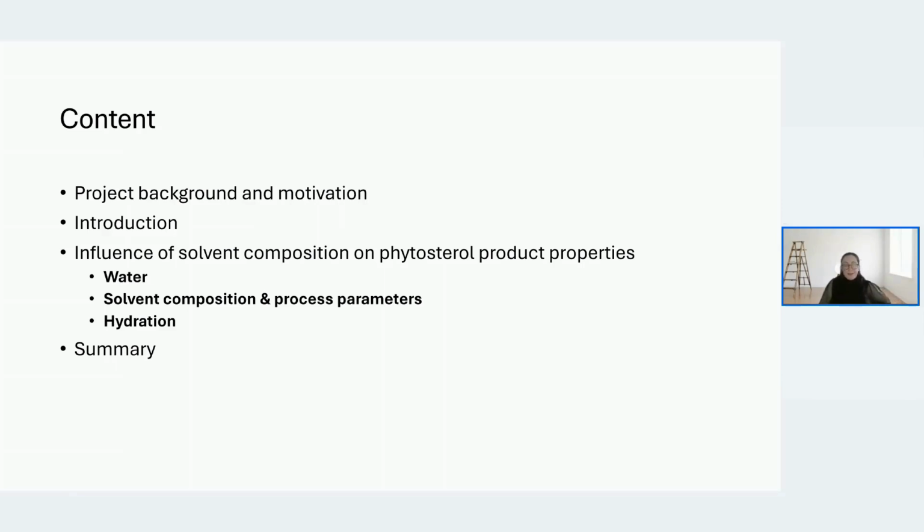And there I would like to raise three smaller items that I want to focus on. One of those being water. Another theme is solvent composition in general and process parameters. And the third topic is hydration. After that, there is a short summary, and I think then we have some time for a Q&A session.